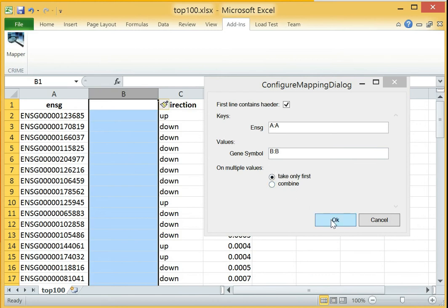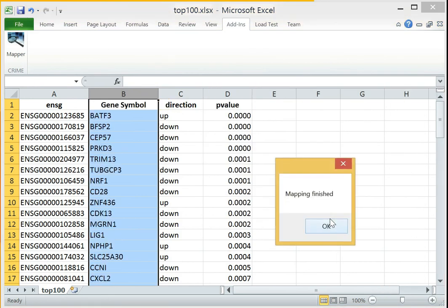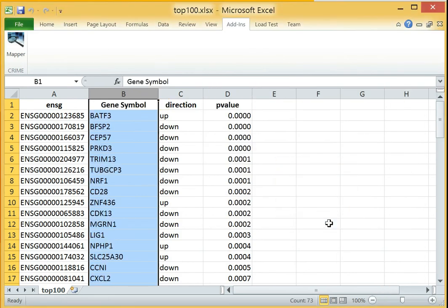As soon as all the required information has been provided, we can start the mapping process by clicking the OK button. Once the mapping has been finished, our file contains the respective gene symbol for each Ensembl gene ID.